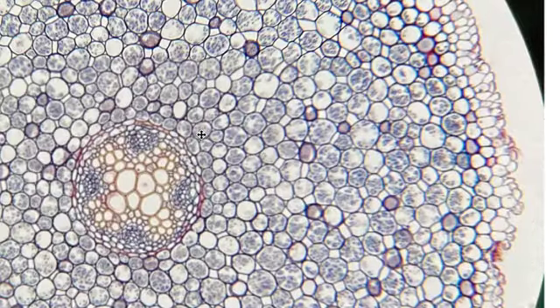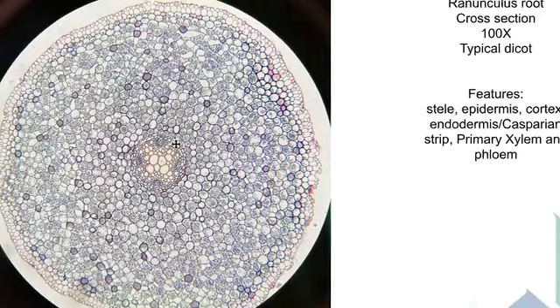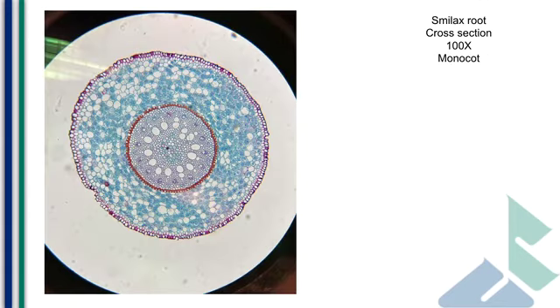And to bring it full circle here, the pericycle that you see is this tissue layer of living cells right underneath our red-stained Casparian strip. So you should draw these structures both as they seem under the microscope, and then wrap up our comparison of the monocot and dicot root in cross-section by drawing some cartoons in the lab. That way you have a simplified version to help you keep track of this long term.